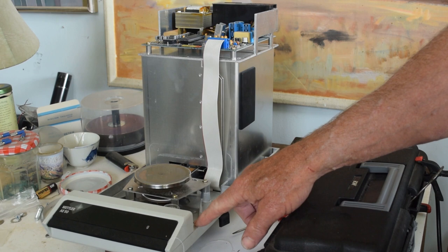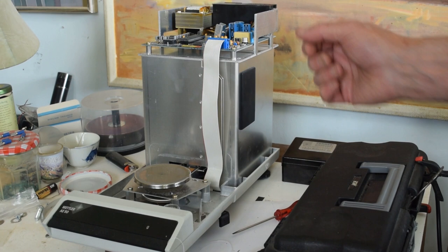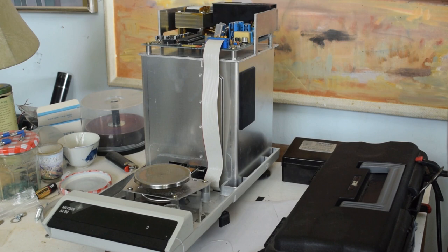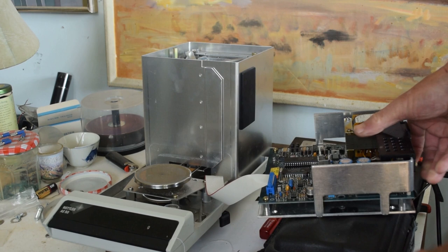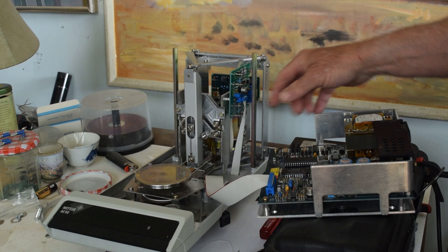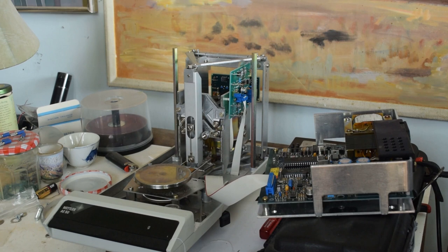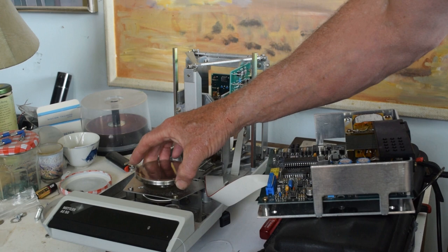Getting the cover off involves pushing down back and then it pops up, and you can lift it straight off. There's a screw here and a screw here, and you can lift it off. This piece comes off this way, and now we're to the mechanism. I bought this one for very little money on eBay as a parts-only listing.